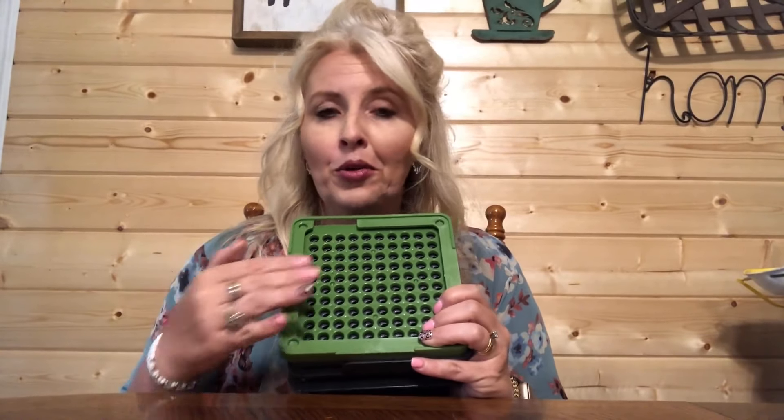This makes a hundred capsules at a time and you just shake them into place, and this even closes it for you. It's very sturdy, it's dishwasher safe, it's easy to do — you'll have no trouble with it. It also comes in three sizes: double-aught, triple-aught, and single-aught.